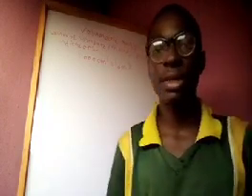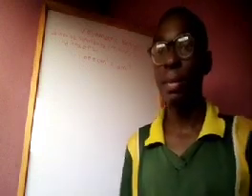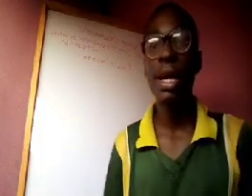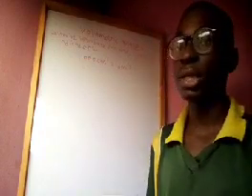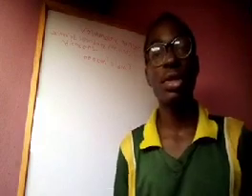I'll make a further series on WAEC practicals, how to predict the value, and all about your practicals in chemistry. But today we are just going through the fundamental basics of volumetric analysis. So now, a standard solution is a solution of known concentration. Then we also have a molar solution.